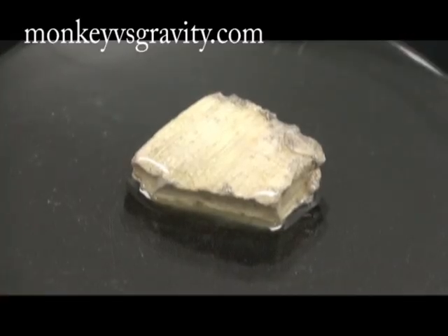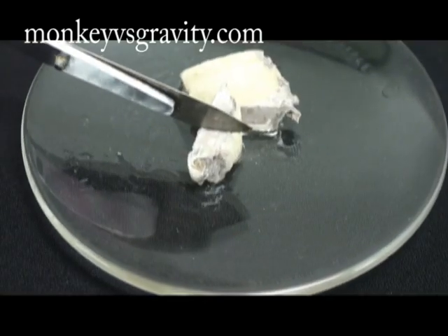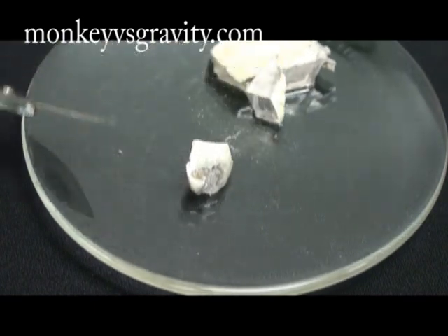Sodium is a silvery metal that is very reactive. When exposed to oxygen in the air, an outer coating of sodium oxide will form. It is also very soft, as you can see, and when it's freshly cut, you can see how shiny it really is.